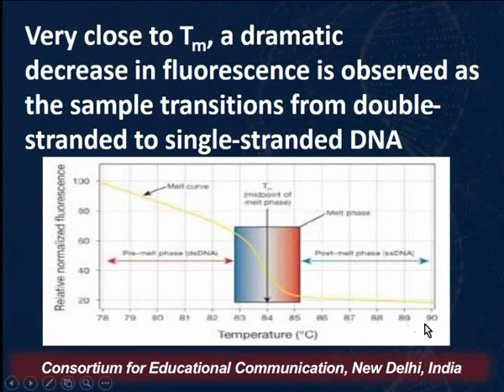So this is termed as the melting curve, and when we use high resolution dyes, this is termed as the high resolution melting curve. So when you compare the melting curves of two double-stranded DNA molecules, then depending upon the Tm, because the Tm of a mutated gene will differ from the Tm of a wild type gene, you can again detect the mutations or SNPs or indels, and you can use this method to detect the genetic variants as well.